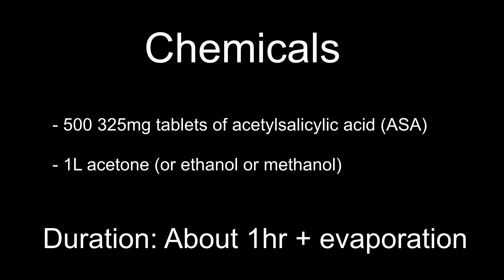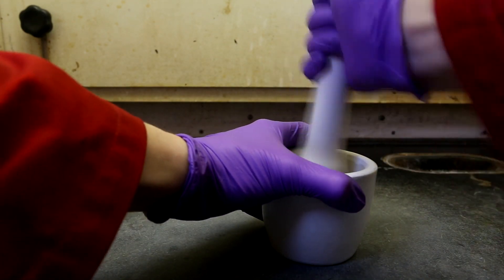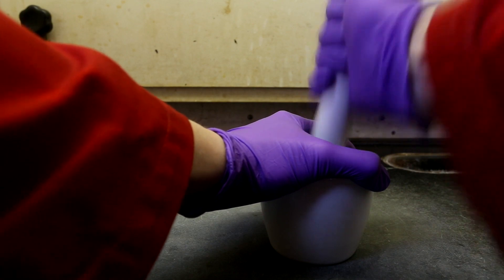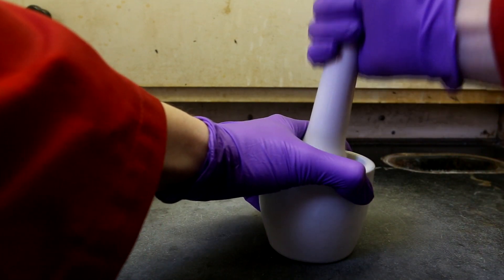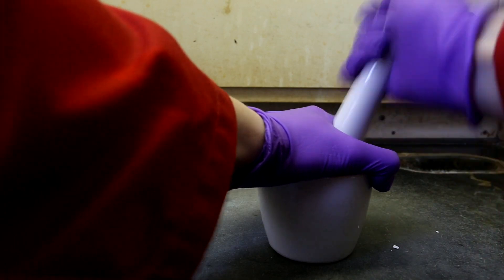Scale the amount of solvent you use accordingly depending on how many tablets you plan to extract from. The first step is to powderize and crush up all of the tablets. You can see here that I am actually struggling quite a bit to crush the tablets, and in my pathetic attempt, some of the tablets even flew out of the mortar.